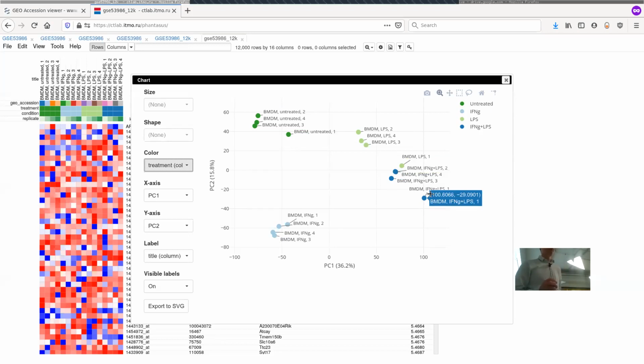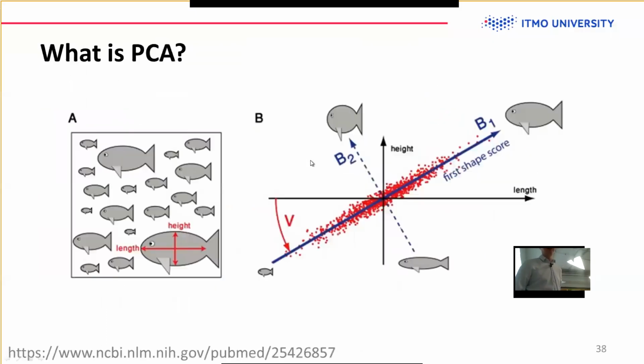While they are kind of close together, it's not that much compared to others. Yeah, and remember the first sample that we saw in the beginning, when we looked at ECAD1 expression, that the first sample was somewhat different from the others. So this actually means that something happens with the first sample. But otherwise, our dataset looks fine.